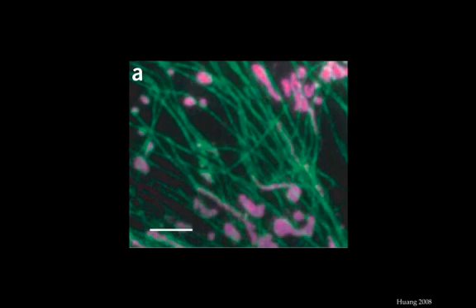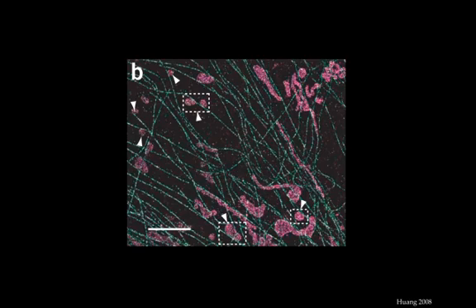They also used two-color staining to study mitochondria and microtubule interactions. Just using fluorescent microscopy, there isn't enough resolution to really see the sort of contacts there might be in any detail. STORM gives us more than enough resolution to see that there are actually mitochondria and microtubules in contact, which would be the case in transport, for example. They could also rule out some very close but false contacts that would be impossible with light microscopy.